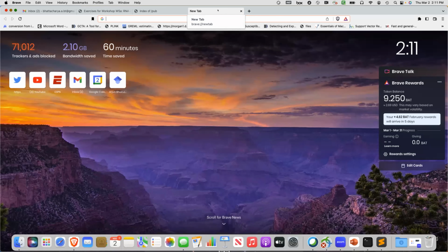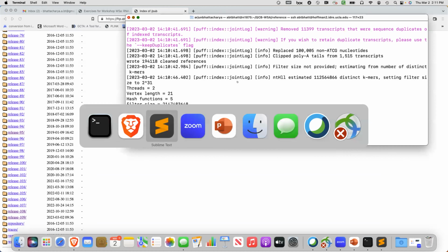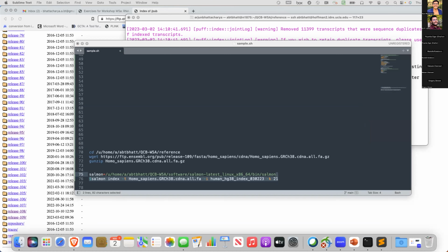Arjun, sorry. Yeah. I just wanted to know what the command was before it, like the whole pathway. I'm currently in QCB W5a, so should I be in reference right now before I write that out?